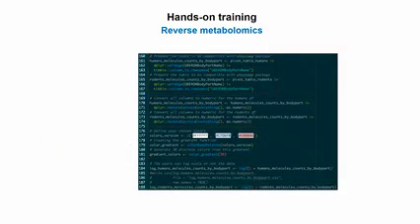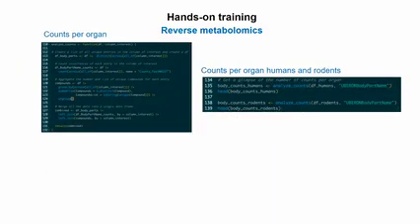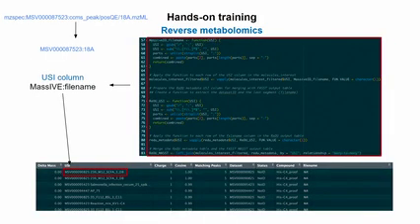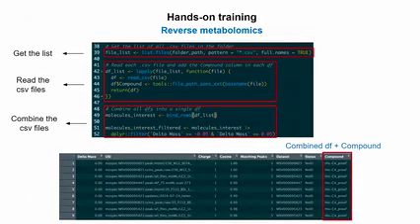You mean at the first part where you filter? Yeah. Here. This should be just the column where you specify that values should be within that range.